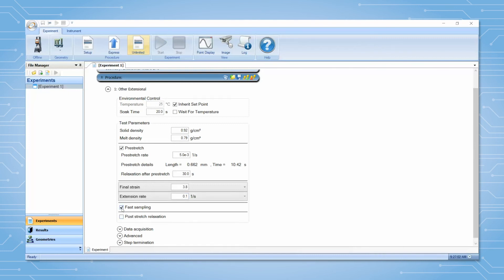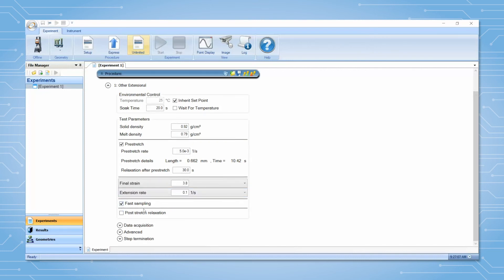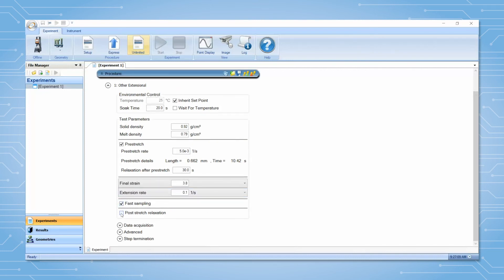Set the data sampling settings. Choose the post-test relaxation if desired.